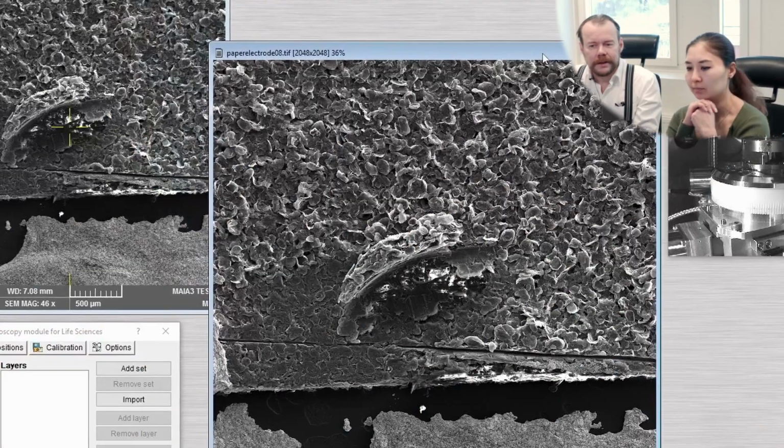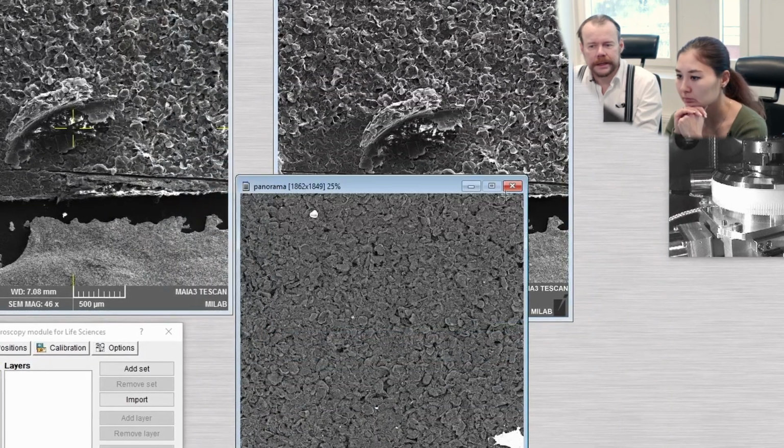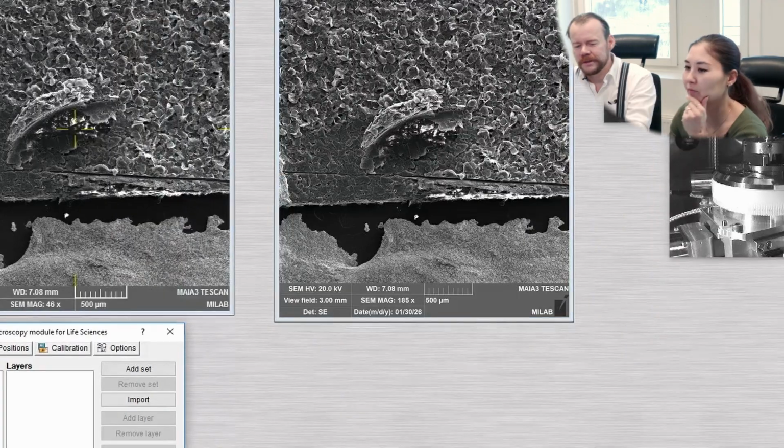So if you want accurate 3D data, then you would preferably use a machine that gives you 3D data directly, not indirectly like this. A profilometer, for example, or AFM. There are other tools that give you that 3D data. But here, we have an image scan. You can take over the controls. I'm so eager to do this.